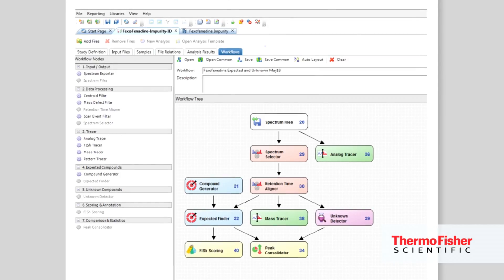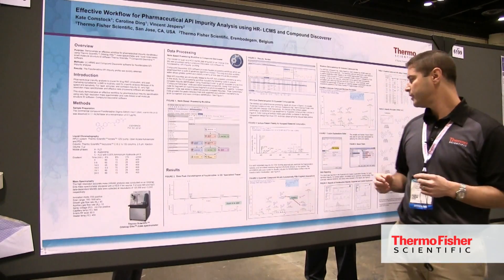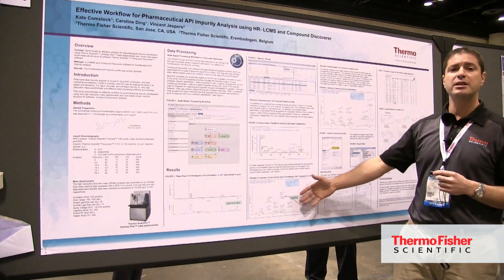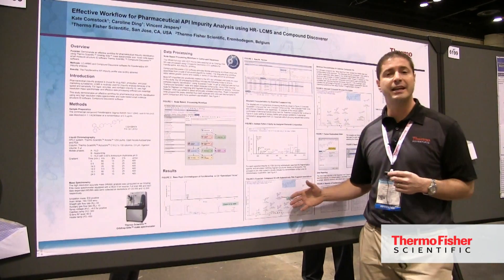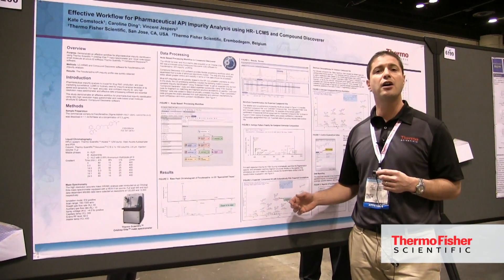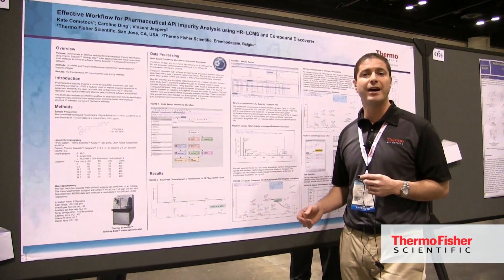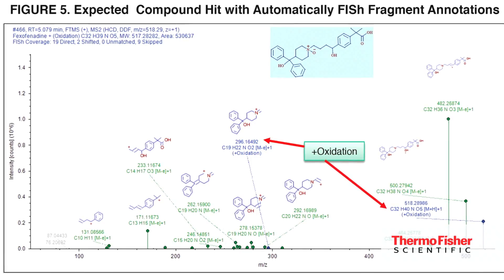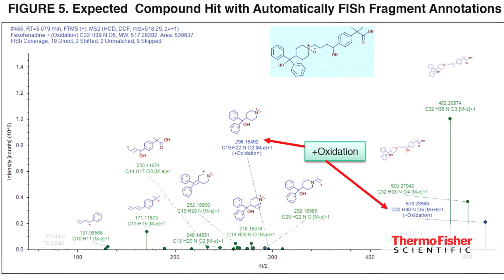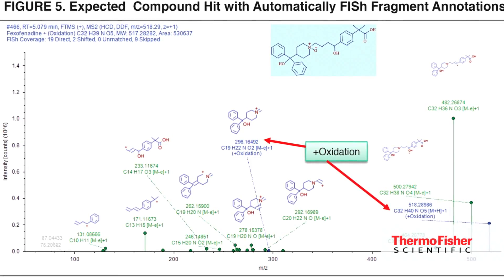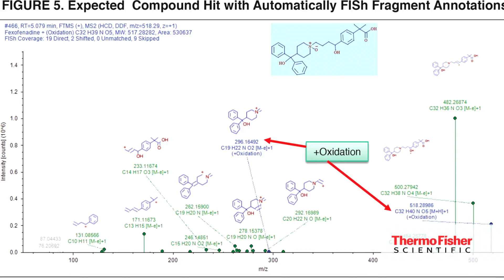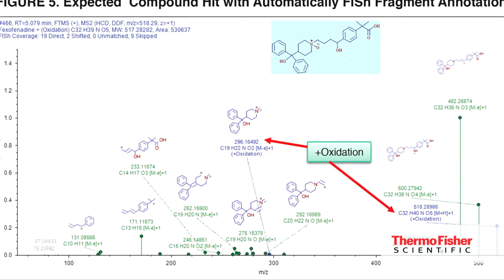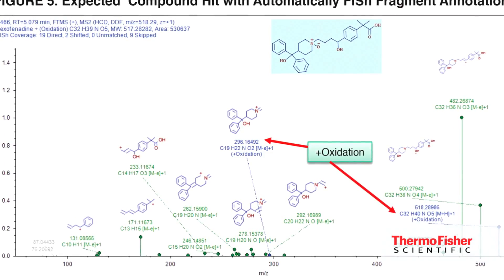Another nice feature of Compound Discoverer is that MS/MS spectra are automatically annotated and color-coded to provide improved ease of use for structural assignment.